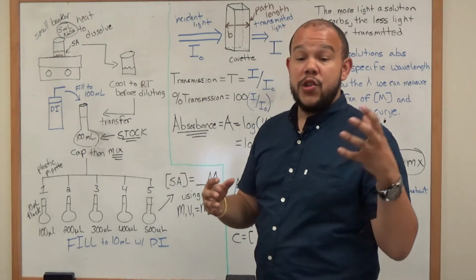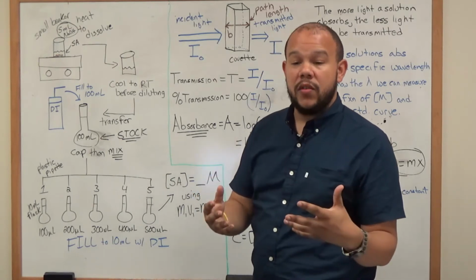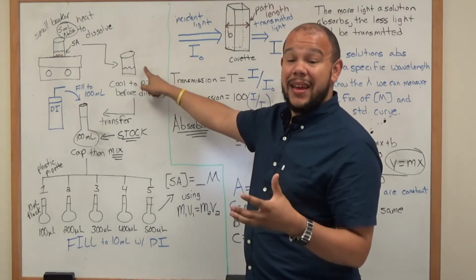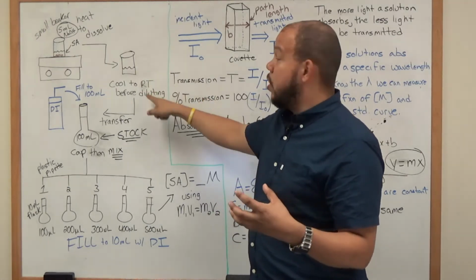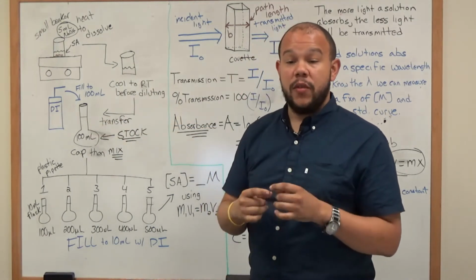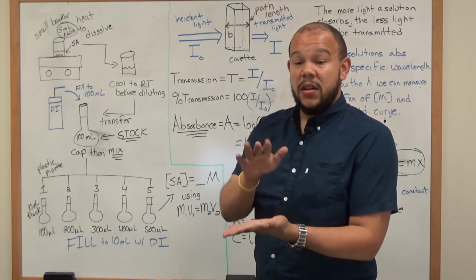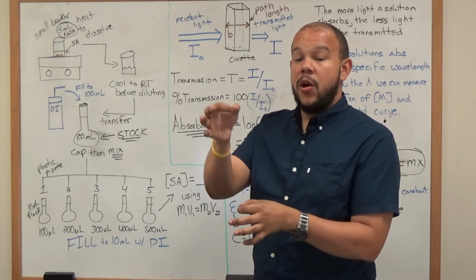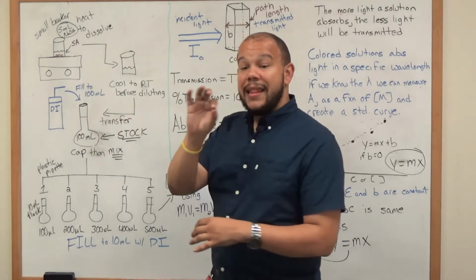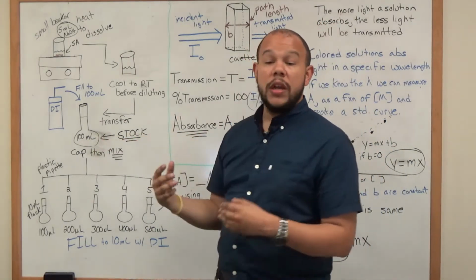Now, in my course, we just started talking about solutions, molarity, and how we use a stock solution. So we're going to transfer the now dissolved salicylic acid in sodium hydroxide to a 100 milliliter volumetric flask. A volumetric flask has a round bottom. It's flat on the very bottom, rounded on the sides, and then it has a long, narrow neck. On that neck, you will see a line, and that line is the volumetric amount that is labeled on each of these flasks.